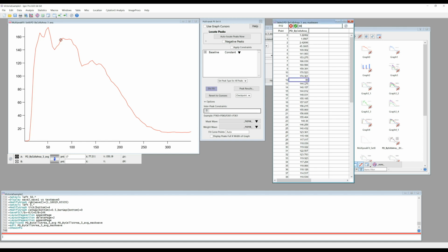So 12 through 17, 0. Now the second dip starts, let's say, at point 24, and it needs to be until 31st. So 24, there we go.